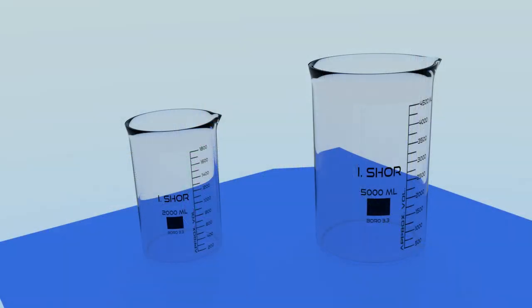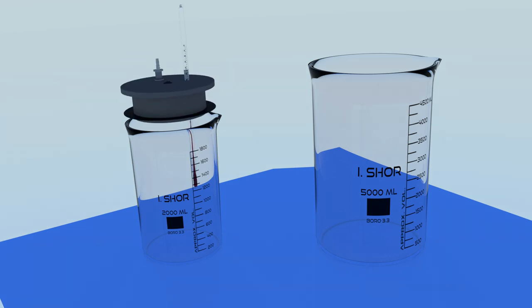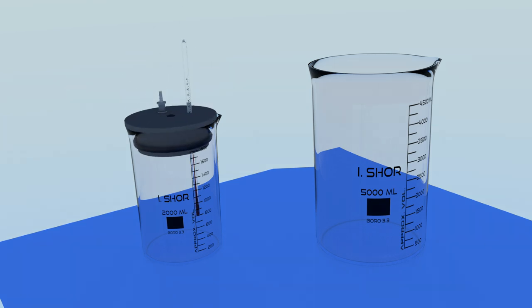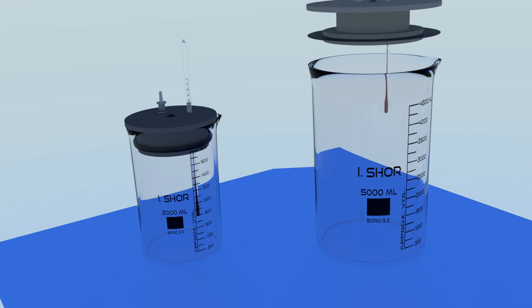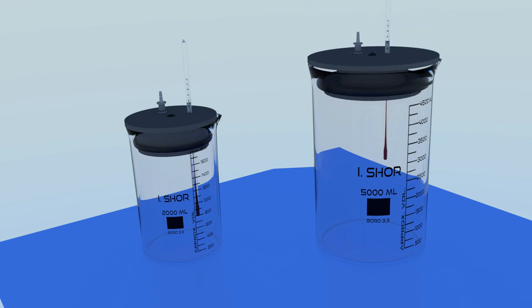Available in two sizes. The AR2L beaker stopper fits 2 litre beakers, and the AR5L fits 5 litre beakers.